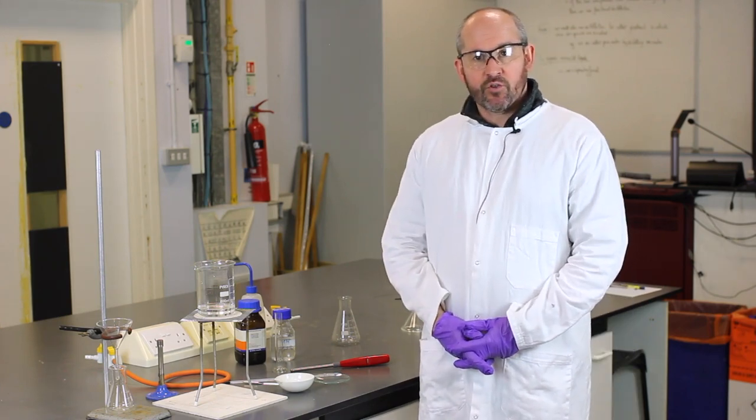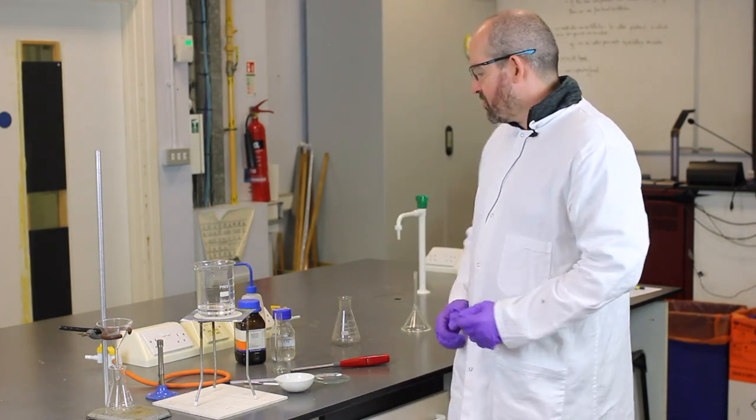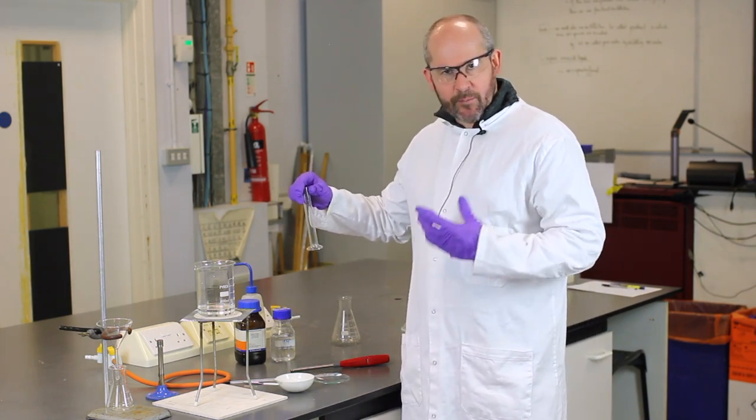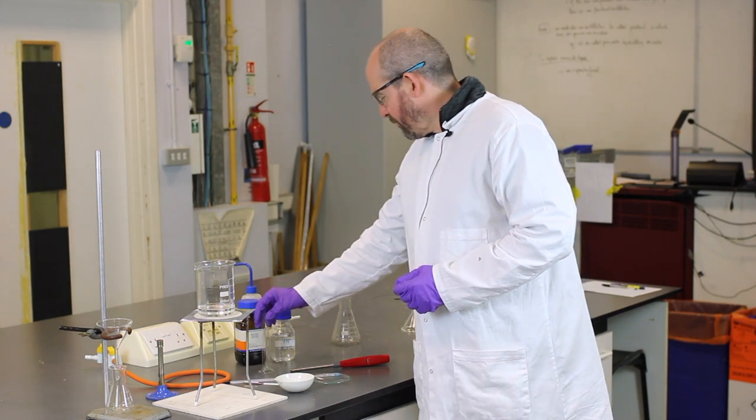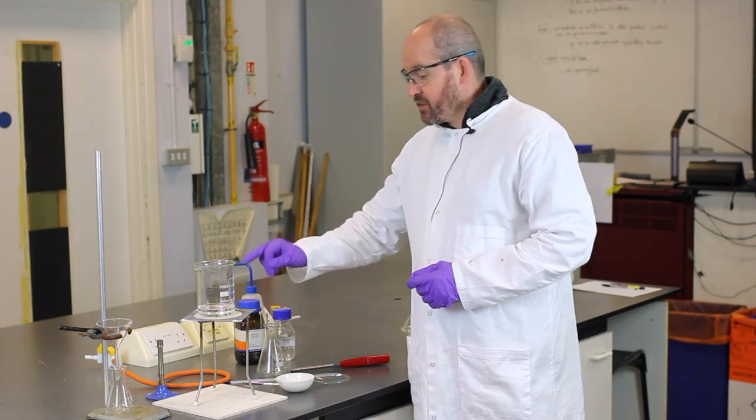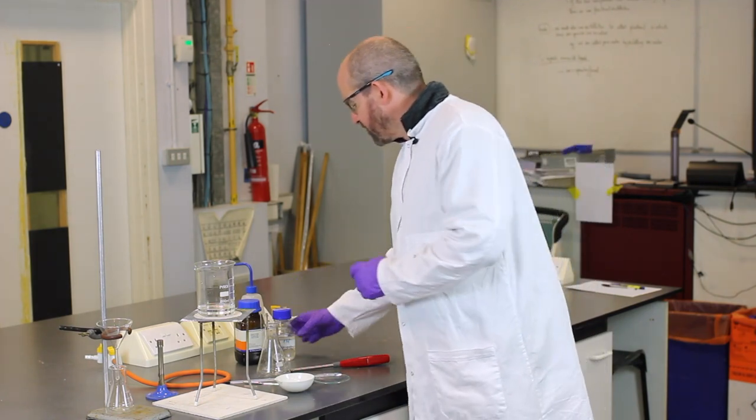So to begin with, what we will do is measure out the volume of acid we require, which is 100 centimetres cubed. So I've got a 25 centimetre cubed measuring cylinder here, so I'm going to have to use it four times, and I'm going to place it in this conical flask. Eventually that conical flask is going to be put in a water bath, but let's get the acid sorted out first.